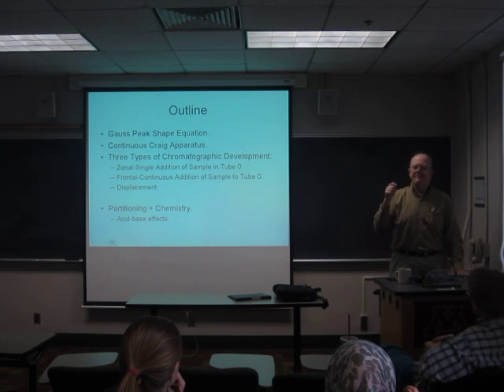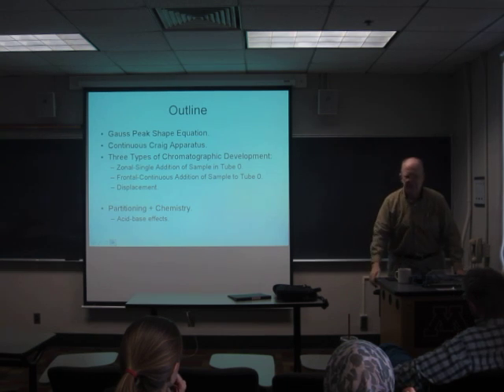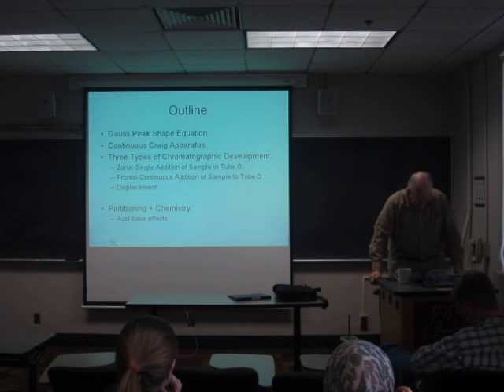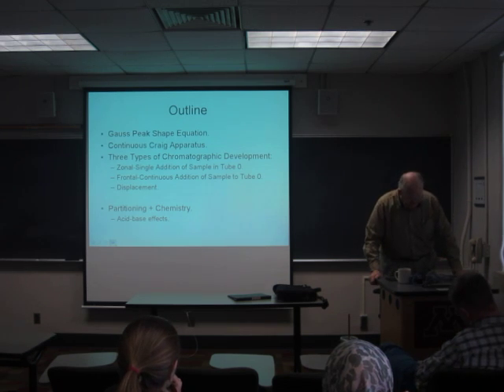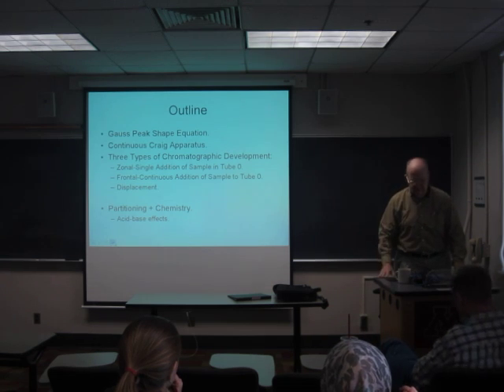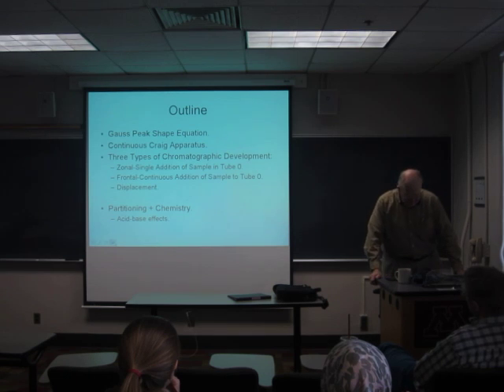If we keep replenishing the sample into the zeroth tube, so that every cycle we add more, that's what's called frontal development. And then there's a third way of developing a chromatogram, which is called displacement development, which you have to see the picture in order to understand it, so I'm not going to tell you exactly what that is.